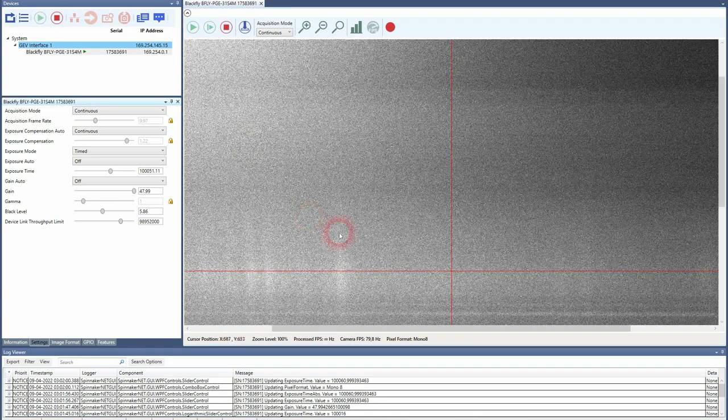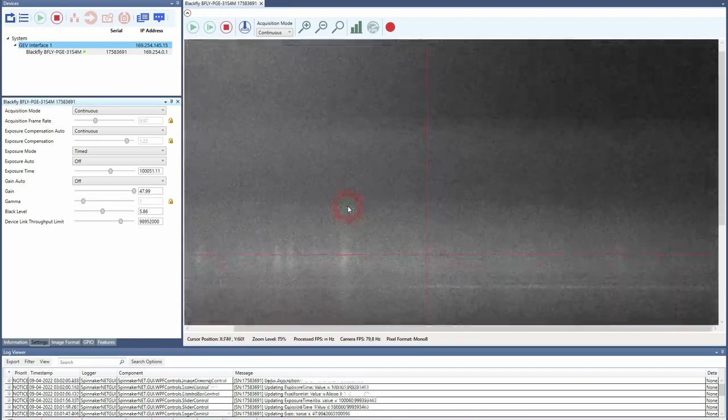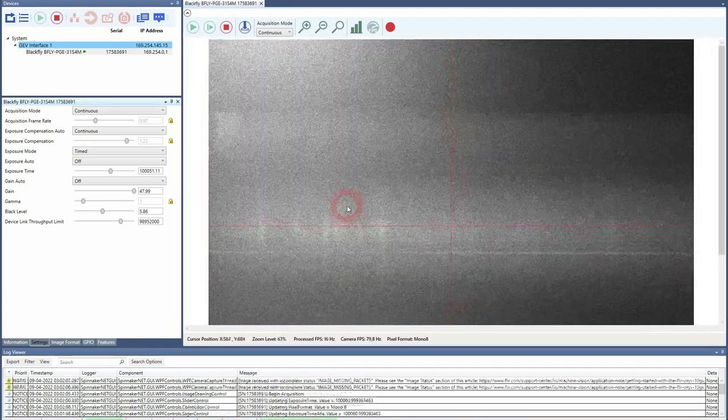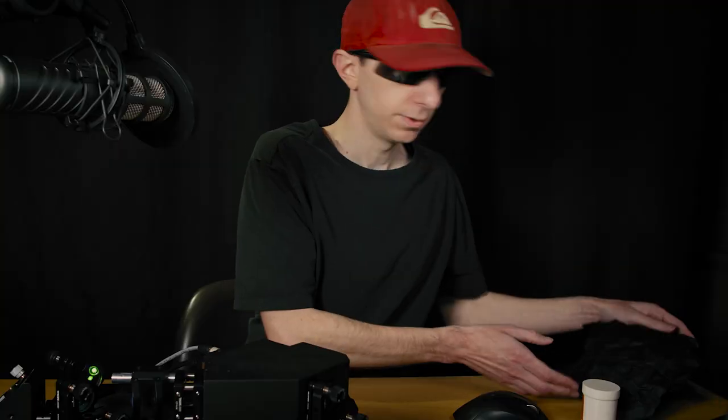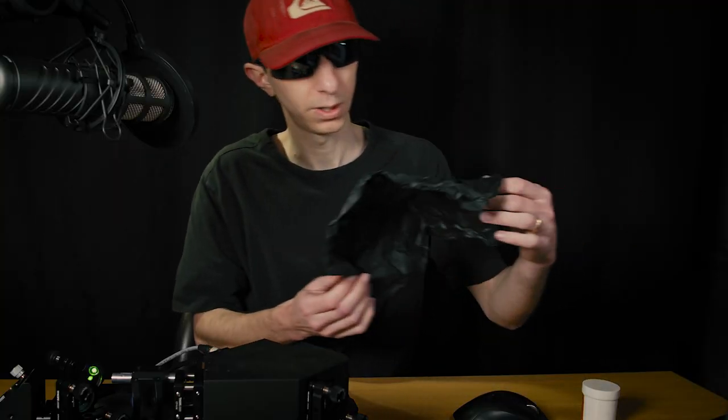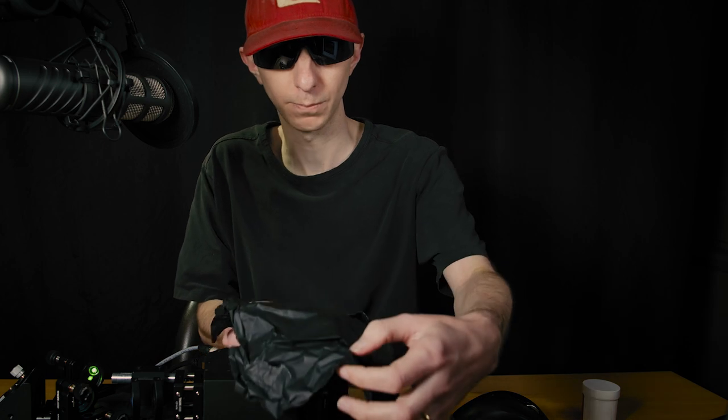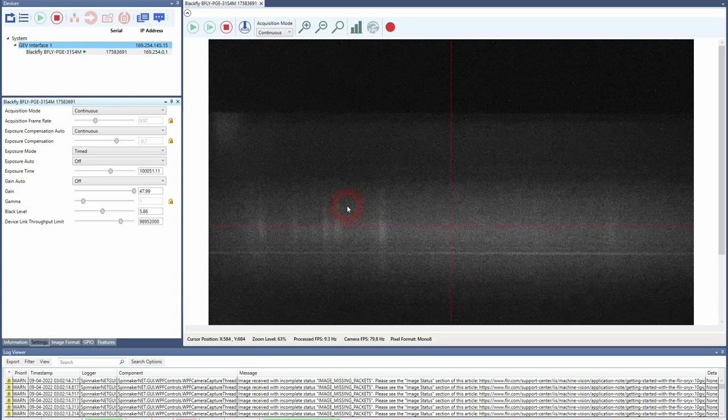Now we can take the acquisition. I will put also some protection because you have plenty of lights at the moment and this introduces some stray light.